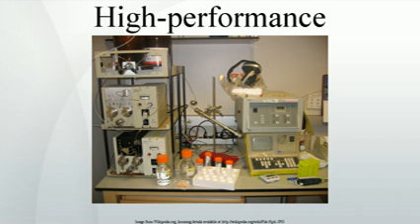Isocratic and gradient elution. A separation in which the mobile phase composition remains constant throughout the procedure is termed isocratic, meaning constant composition. The word was coined by Csaba Horváth, who was one of the pioneers of HPLC. The mobile phase composition does not have to remain constant. A separation in which the mobile phase composition is changed during the separation process is described as a gradient elution. One example is a gradient starting at 10% methanol and ending at 90% methanol after 20 minutes.